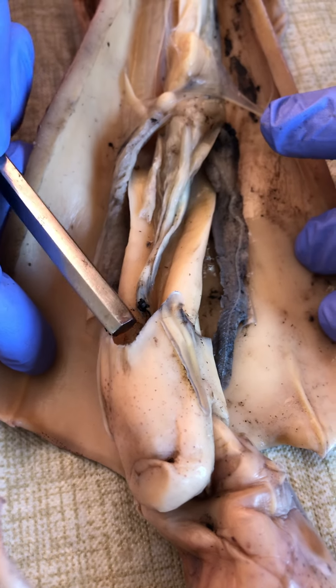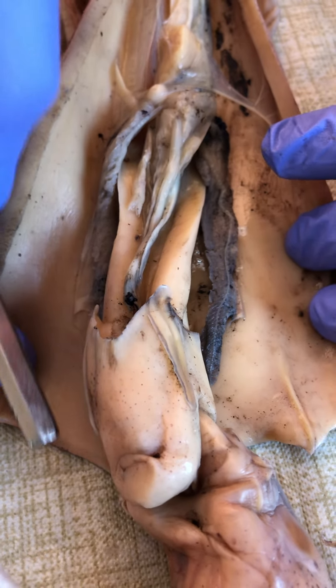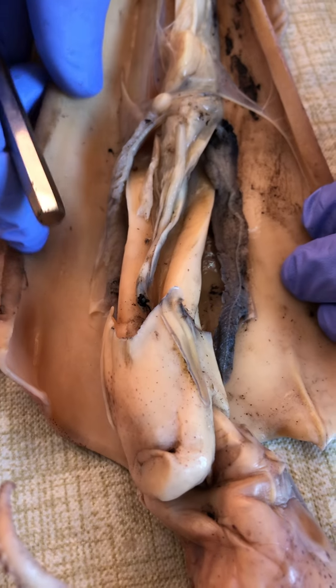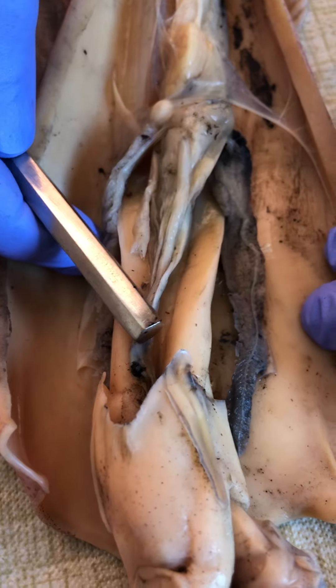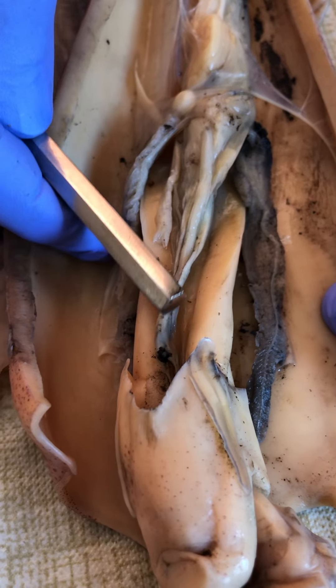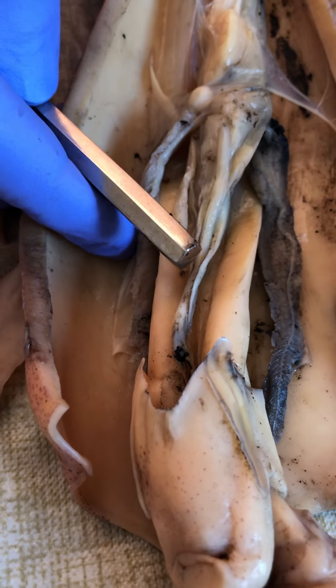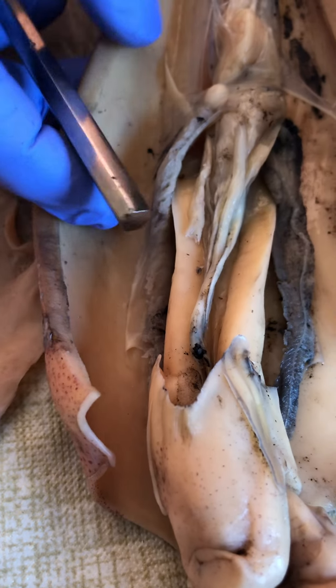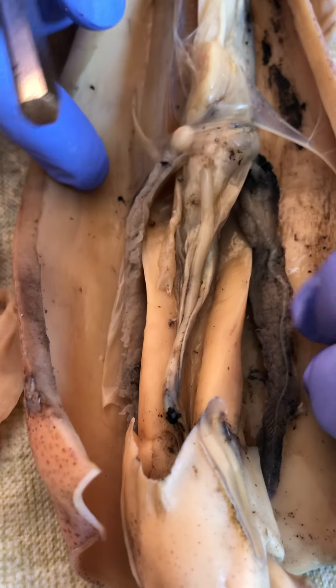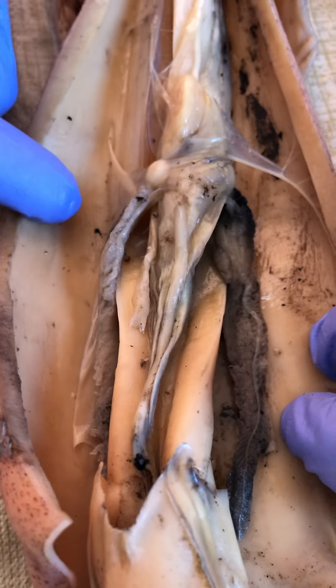So anything that enters the siphon is gonna be shooting out the siphon. And again we have the rectum and the anus, with the ink sac close by. But let's go dorsal to ventral this time.